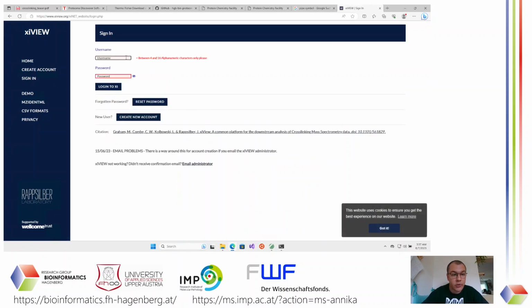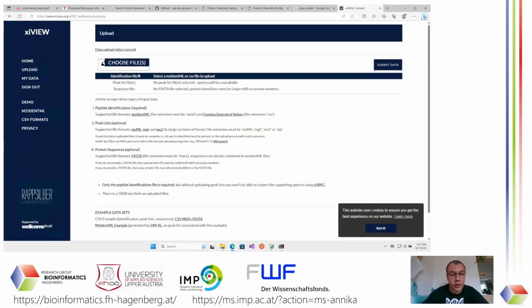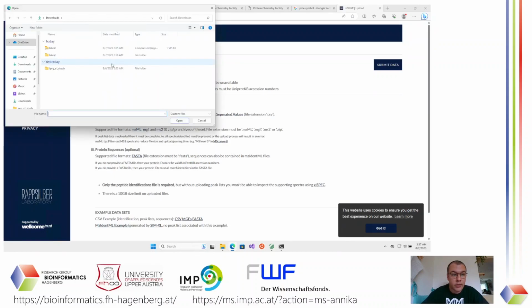I already have an account, so I'm just going to sign in with my credentials. You will be presented with this window, and what you will do is go to upload data and choose your files.